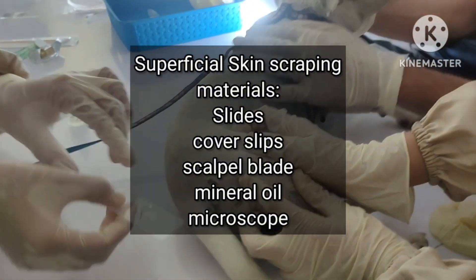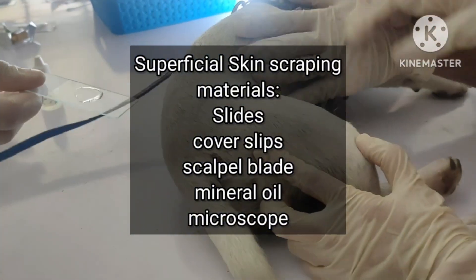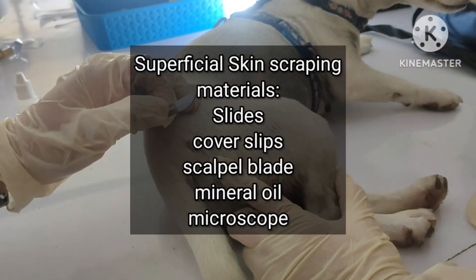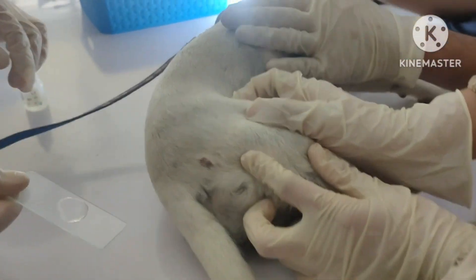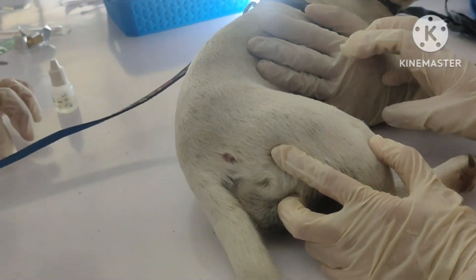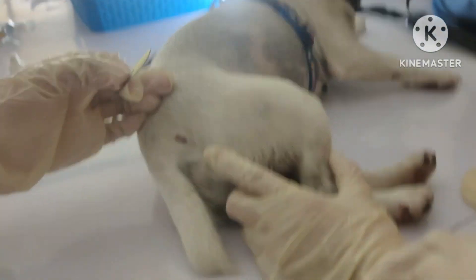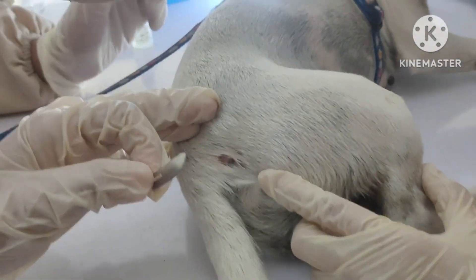Materials needed for superficial skin scraping are slides, coverslips, scalpel blade, mineral oil, and microscope. If necessary, gently clip the affected areas, leaving 2-3 mm of hair so that the scales and crust are not dislodged.